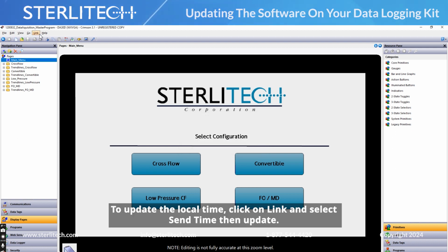From there, go ahead and select Link one more time. We just want to make sure we update the time so that it's logging at your local time zone. Click on Send Time.